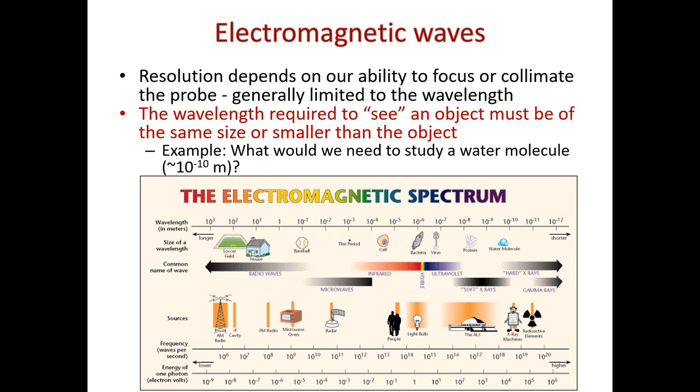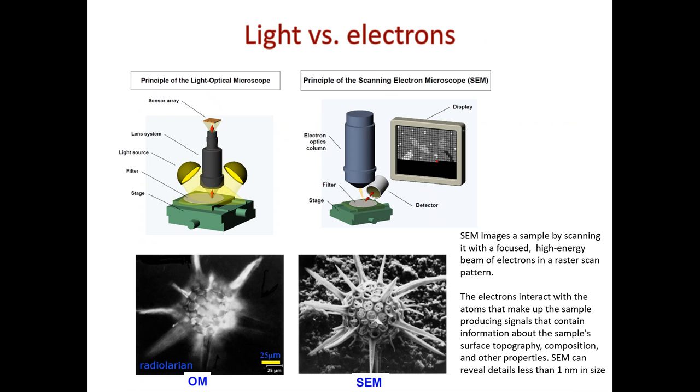is really useful for resolving pore spaces in sandstones. Okay? If I want to image carbonates, I need even better, especially for microporosity, which is often submicron. So for that, you will often have to go to microscopy, scanning electron microscopy. And if I want to do unconventionals, which is right now a booming area, you have to do way better than X-rays in terms of resolution, and we will review those as well.